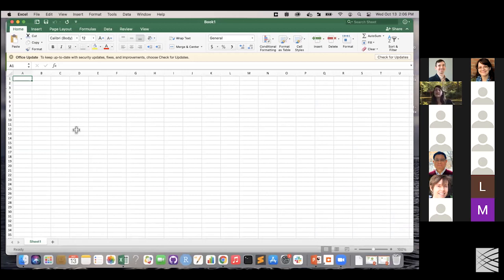So instead of calling my data table specimen, I'm going to call it a sample data table. And just like in the specimen data table, the first column of my sample data table needs to be a unique ID. And in Terra, when you create these tables, it has to use a very specific syntax. So to create that first column, you have to say entity, colon, whatever you want your entity name to be. So in this case, I want to call my table a sample table, and then underscore ID.